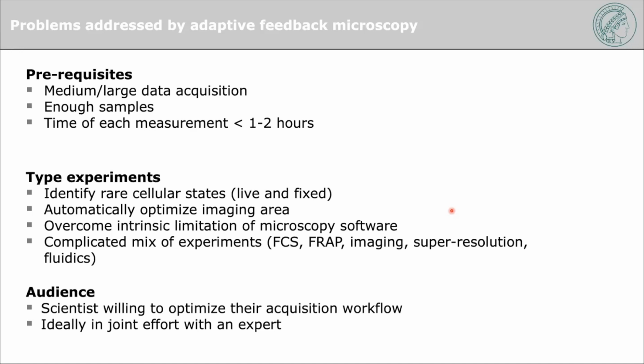And the audience, yes, that's really a good question. So who is the expert? I mentioned this a few times today. I work in a facility, so I like how facilities are conceived, so that basically you can discuss with the scientists, and they're willing also to optimize the acquisition workflow in order to achieve this higher throughput.